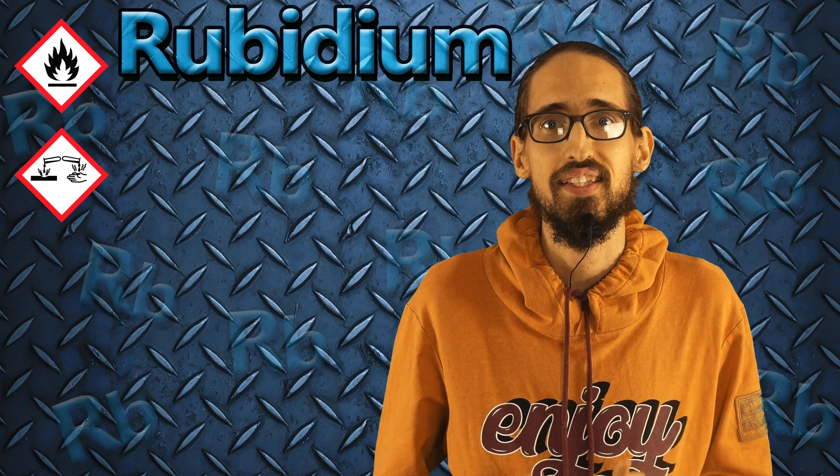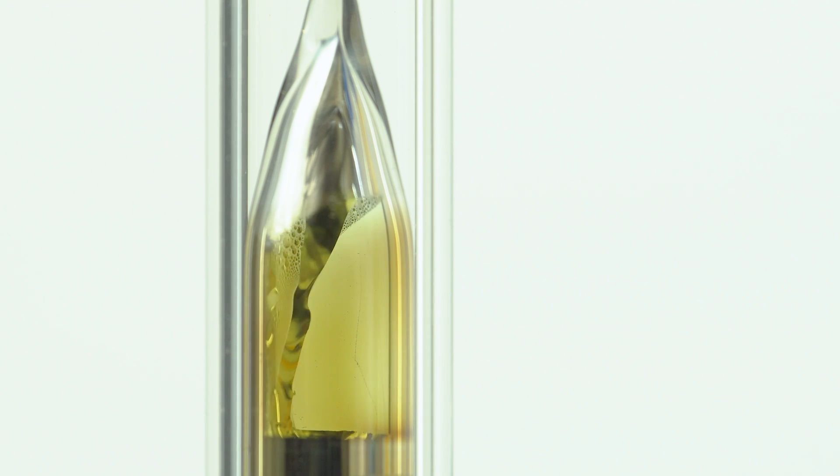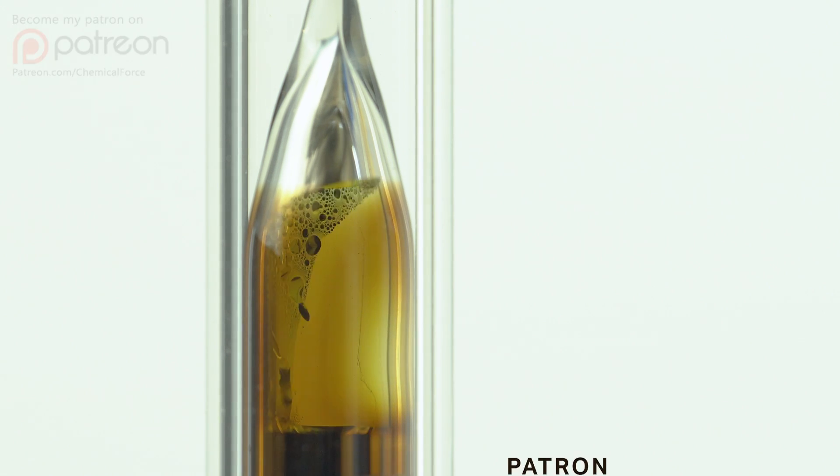As you can see right now, I'm strongly heating the ampoule with rubidium and it's gaining a bronzish color. Where does this color come from?